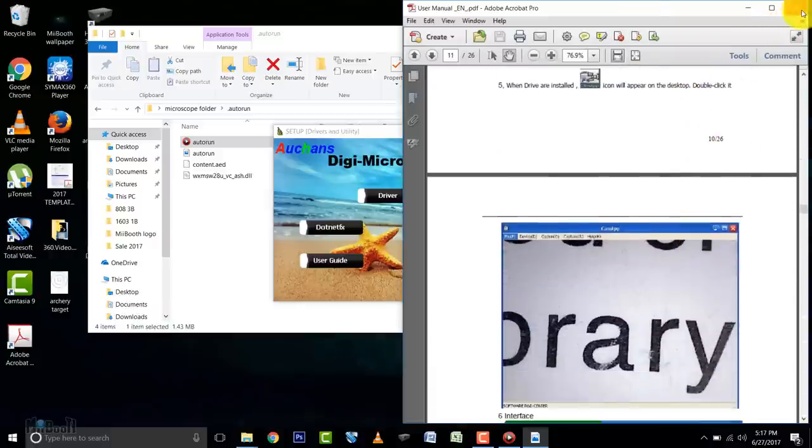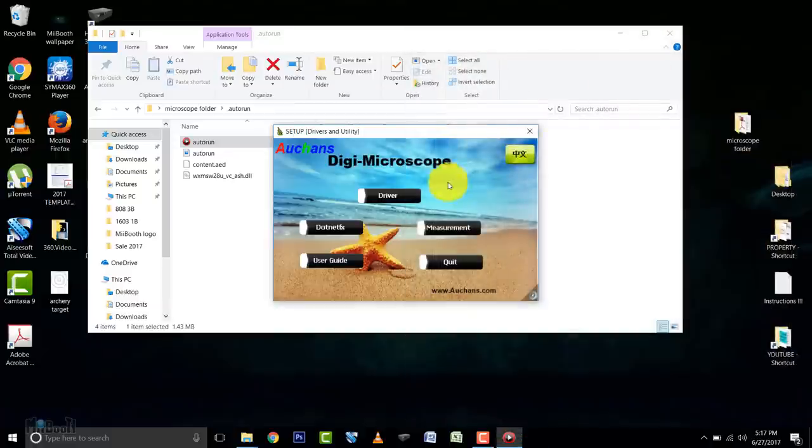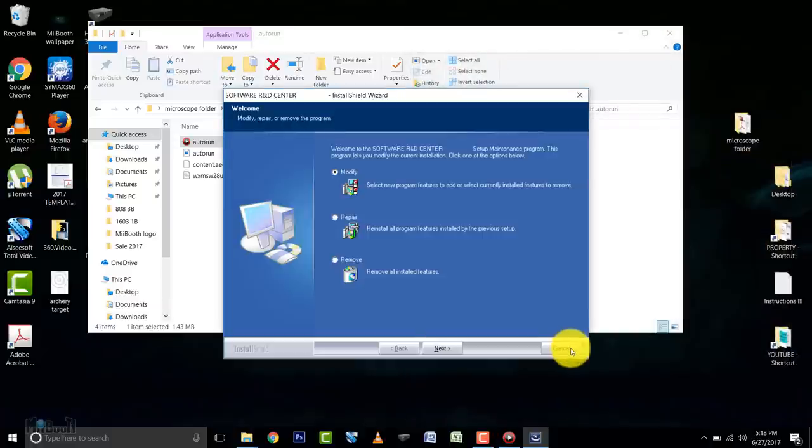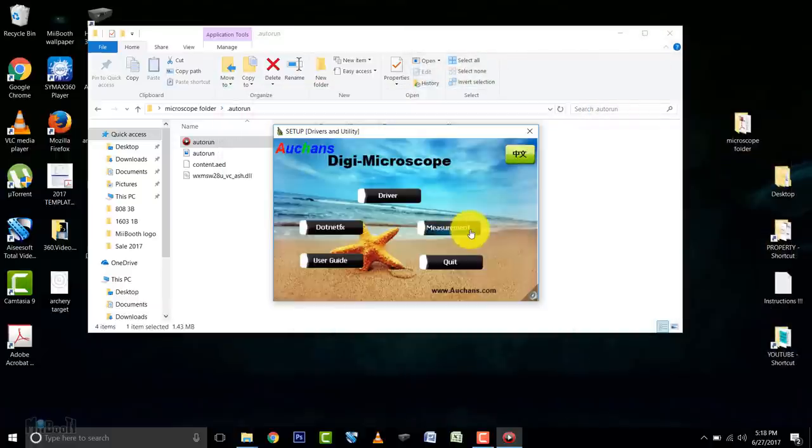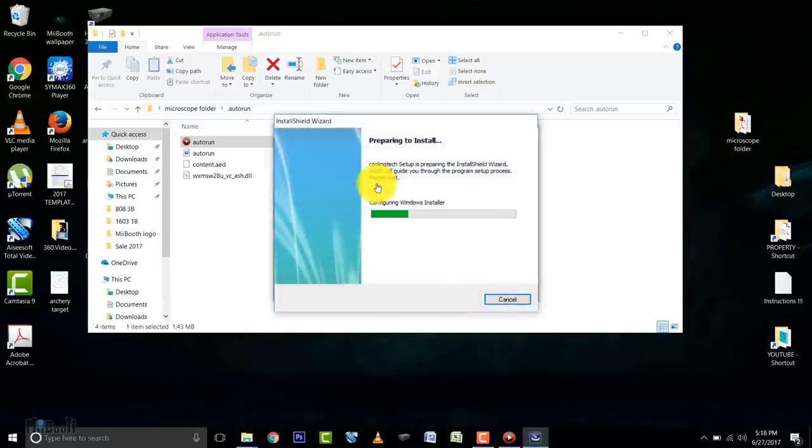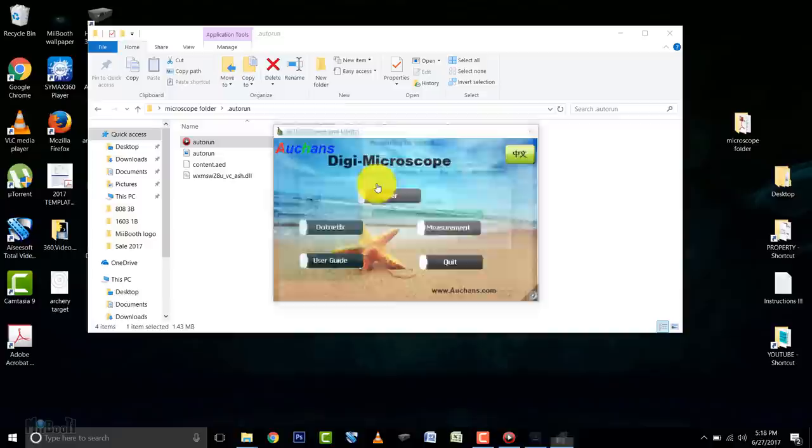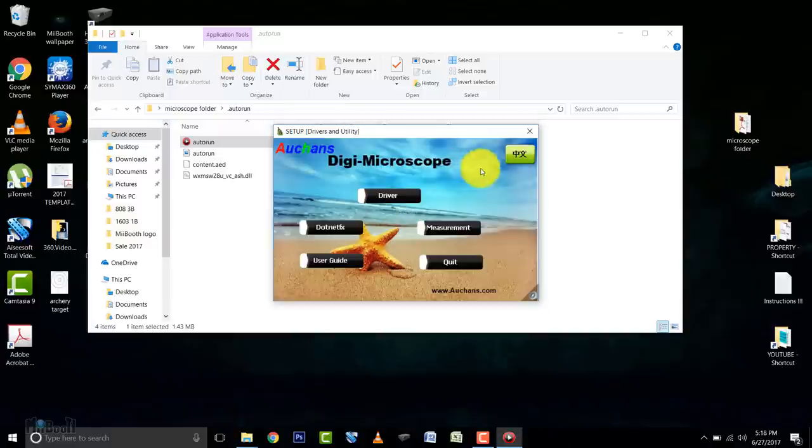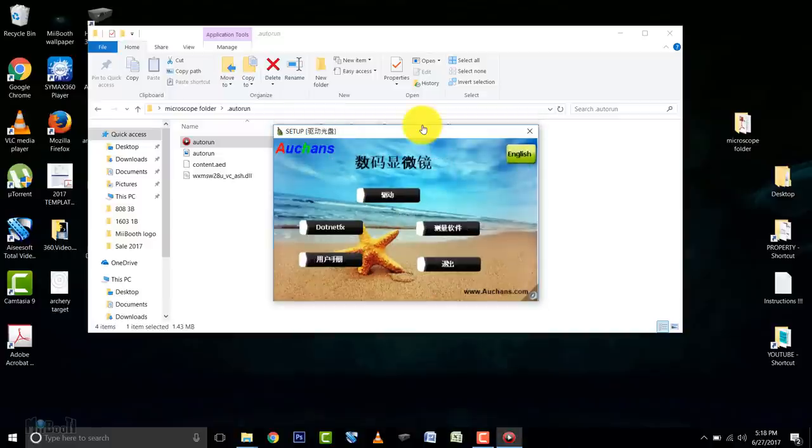Now we need to install the driver, so I'll click on it. Next, next, and it's done. I've already done it, so I'm not going to do it again. Next I'll click on this button which says measurement. This will install a second app which we can calibrate to measure stuff. This menu is also available in Chinese, by the way.